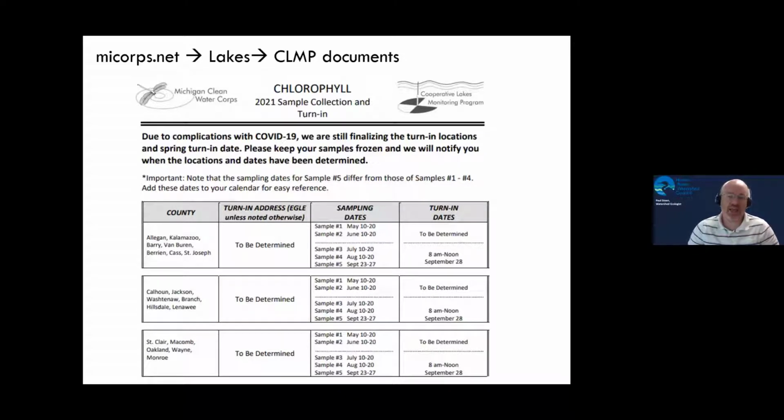Just like Eric said, we haven't determined exactly when these samples will be turned in. It's very important, and we'll talk about this more later, just to keep everything frozen. You'll have all these chlorophyll filter samples. Just keep them in your freezer till we release all those details about where to turn them in.